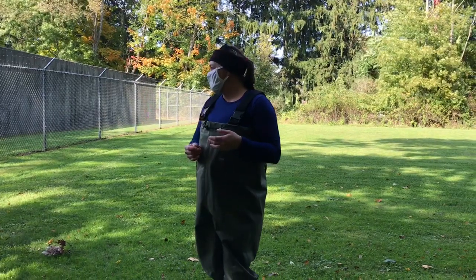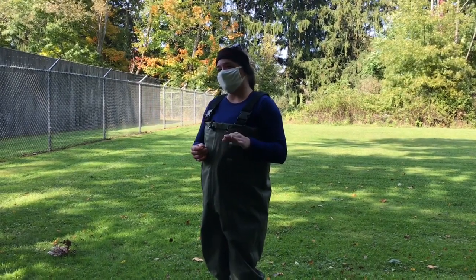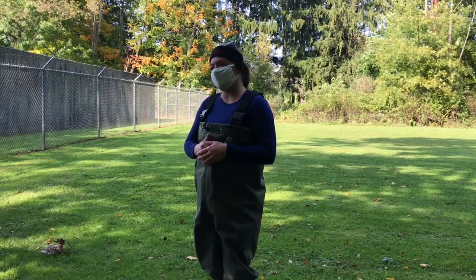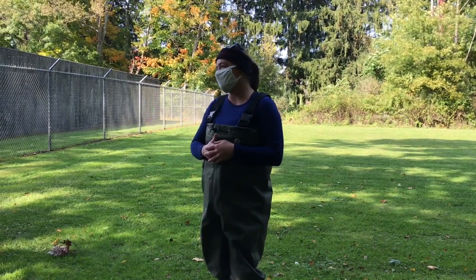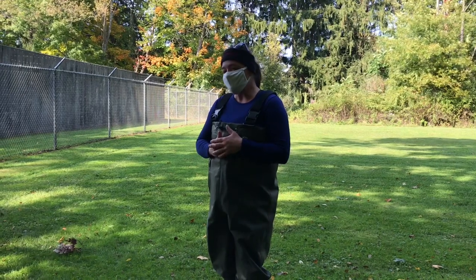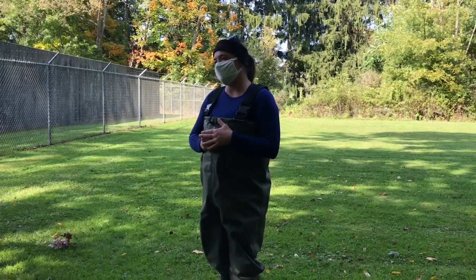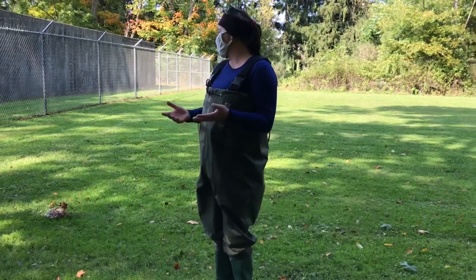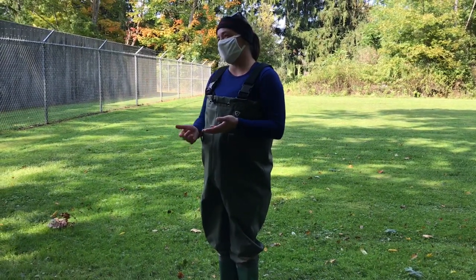communities. So, macroinvertebrate communities are really good indicators of water quality, as you may or may not be aware of, and you'll probably read a little bit more about it. But we can use data from macroinvertebrates to tell us how we're scoring in a water quality aspect.